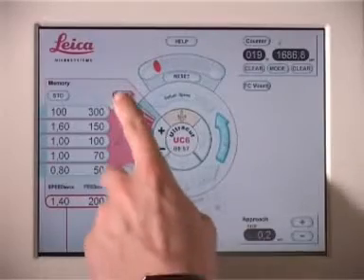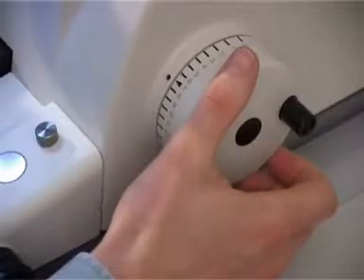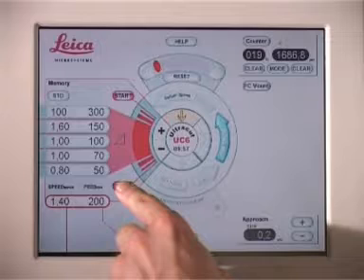Using the higher magnification of the stereo microscope, the gap between the knife edge and the block is now highlighted and the alignment can be taken to its final stage.